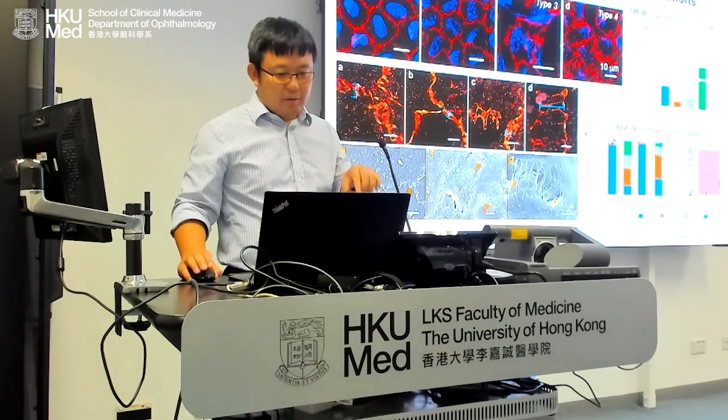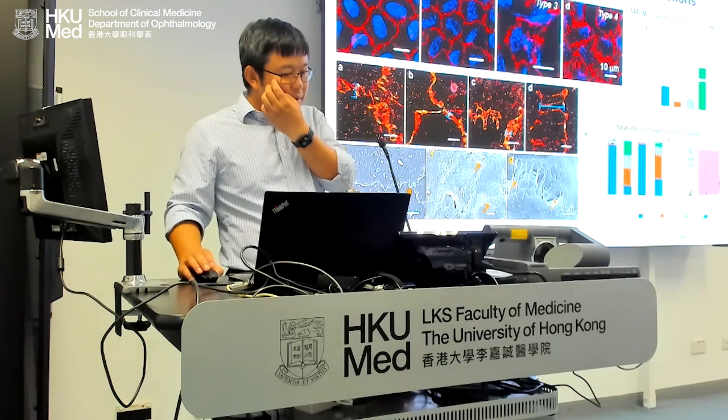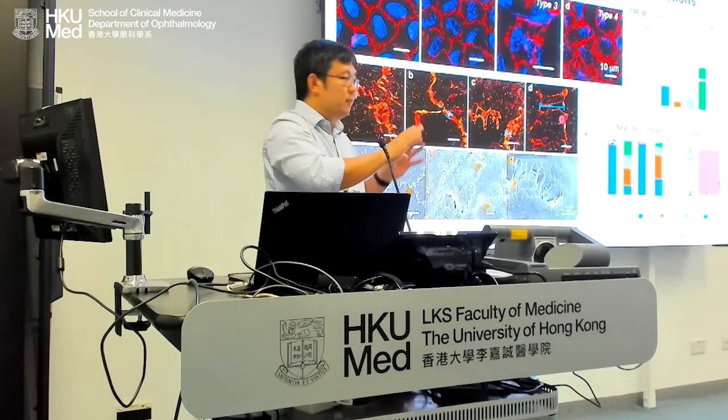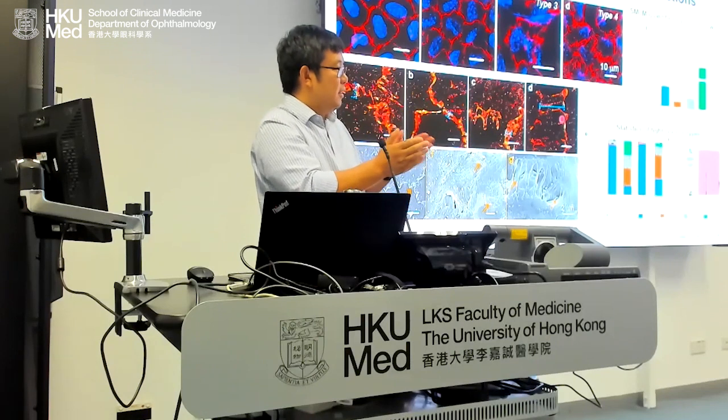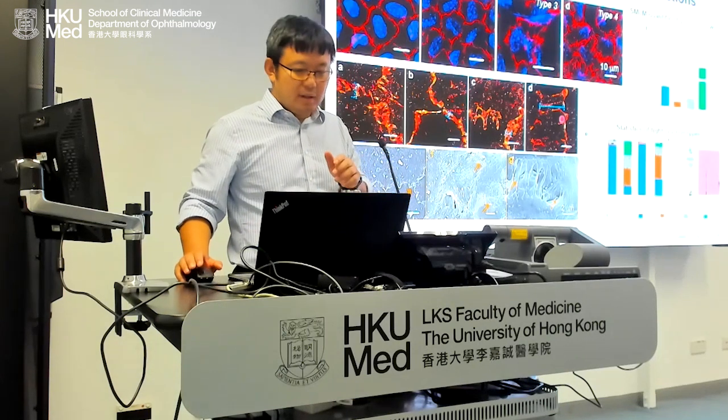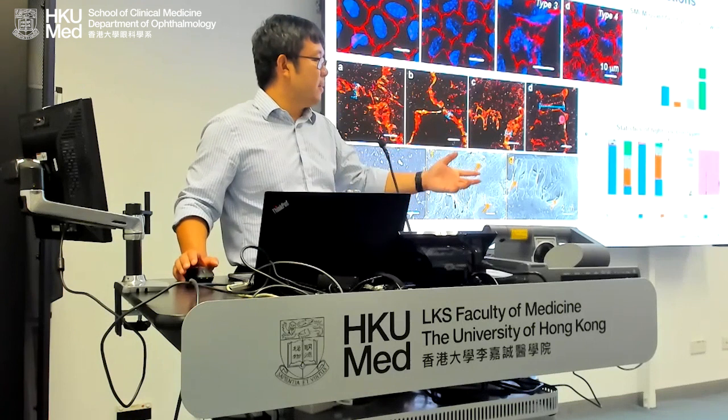So I get your question. The question is, what additional information did super resolution provide as compared to confocal in this particular panel? In this particular case, the super resolution provides a quantification of the level of damage at the nanoscopic level. And that's the major value, especially because the damage is a continuous change. There's no gap. So there are 4 types, but how do we define the 4 types so that they make sense? We have to do a statistical analysis, and the statistical analysis requires the highest possible resolution to define the distance.